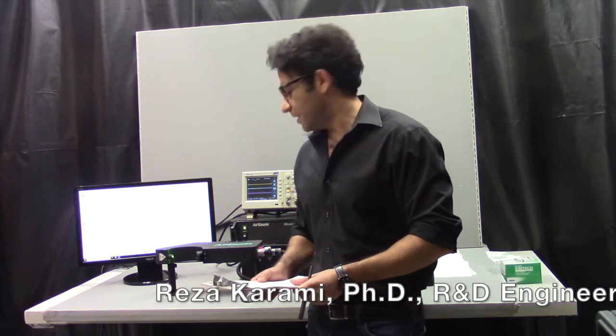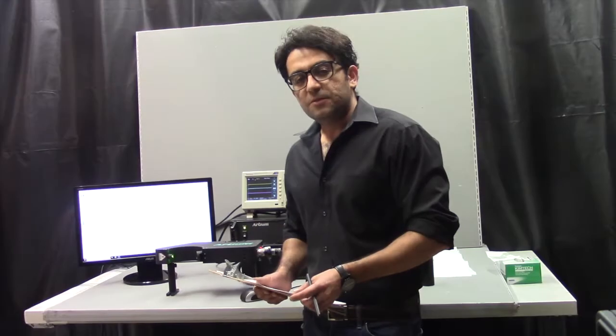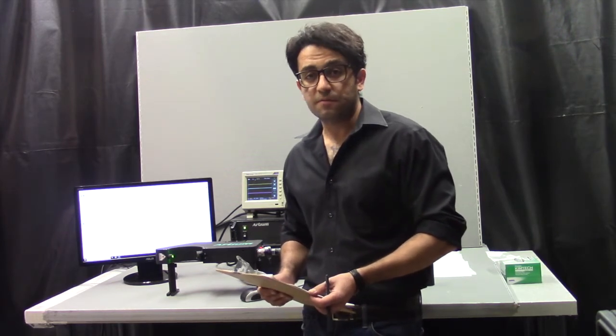I am an R&D engineer at Artium Technologies. We are located in Sunnyvale, California. What we do at Artium Technologies is make instrumentation that measures the size, the velocity, and the shape of tiny particles.